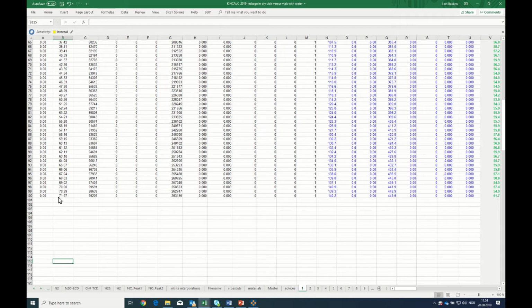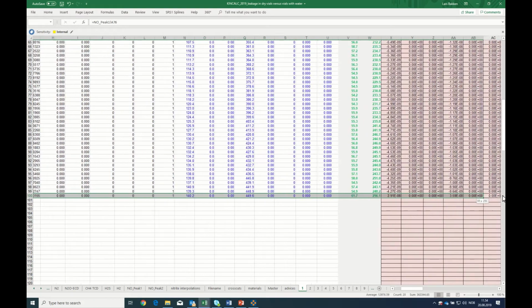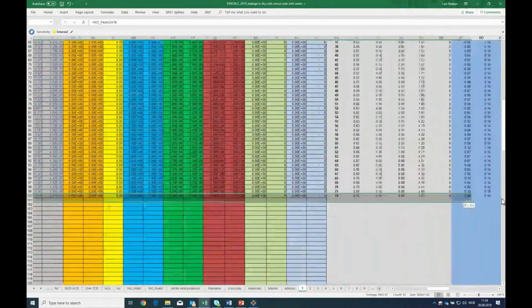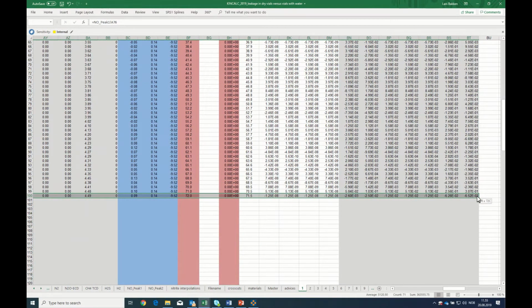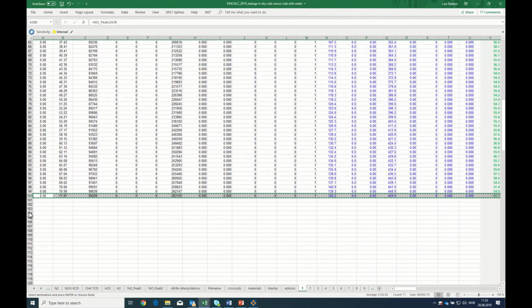Now, in order to include the remaining measurement for the sheet to pick up the raw data from that, I need to mark the line. I can do it this way, or I can mark it on the very left column, but I do it this way just to illustrate what I'm doing.